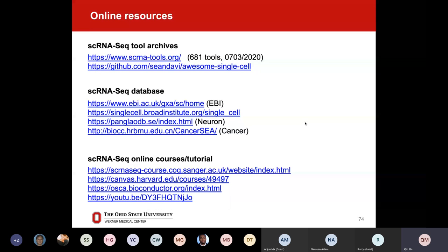This slide shares some resources. I definitely cannot go through them one by one, but these links are very good resources. For example, if you are new to single cell data, these links should be very good for self-education. Let me click on the first one — let me stop sharing and share again. Now you can see the website. This is the first website called 'Single Cell RNA-seq Tools.' It currently has 681 tools for single cell data analysis, with a ranking ladder.